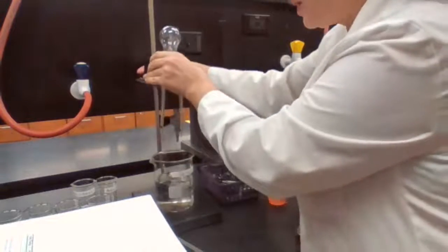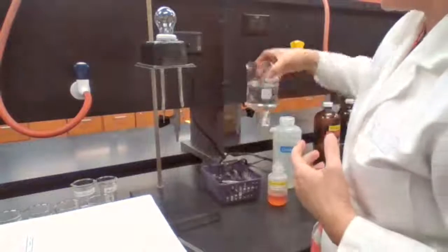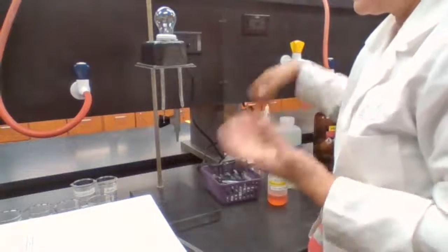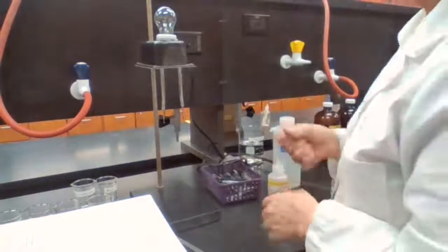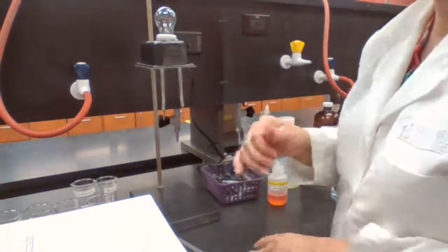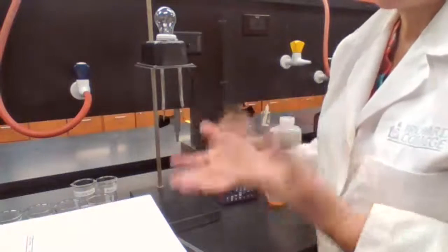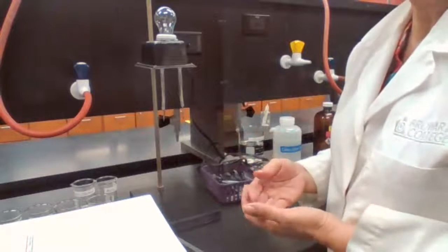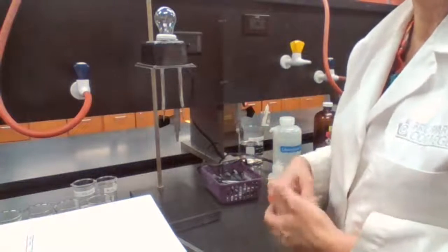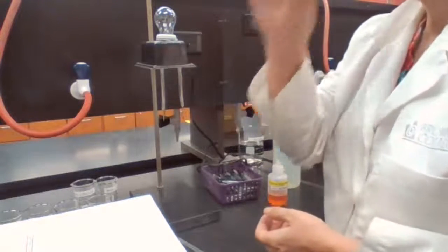It could have some salt in it, from the chlorine or other contaminants in the tap water. So tap water is a conductor of electricity, but distilled water is not. Seawater is a conductor of electricity because it has lots of ions, lots of salt. The more salt, the better the conductor.